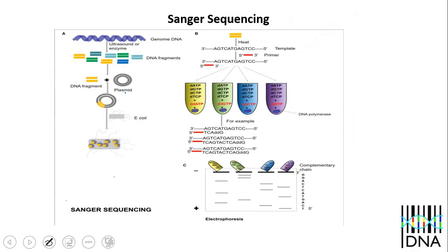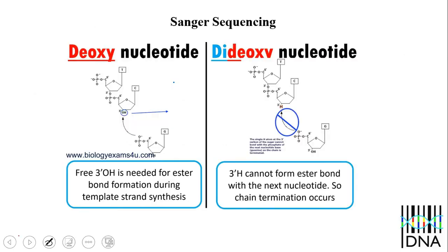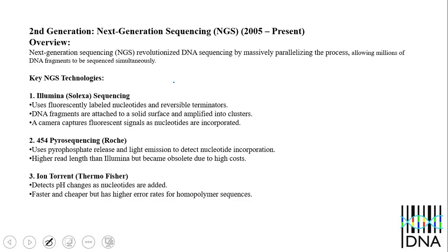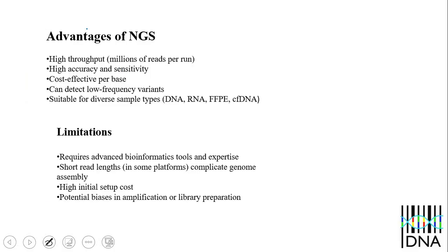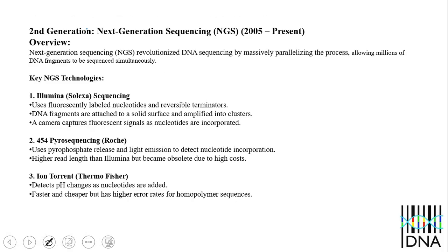Now we discuss a little bit of idea about Sanger sequencing. Now we discuss the second generation of sequencing, known as NGS, and this is the main topic of our internship program.